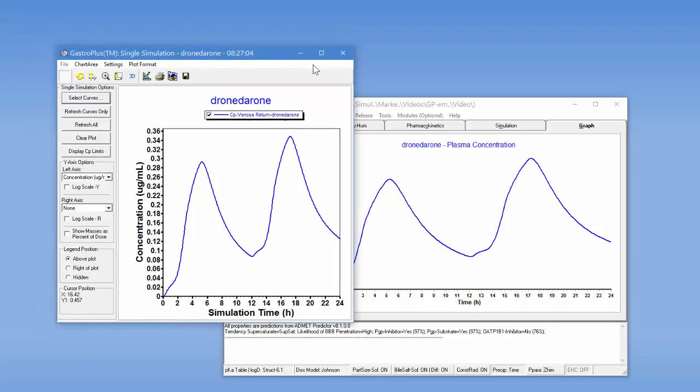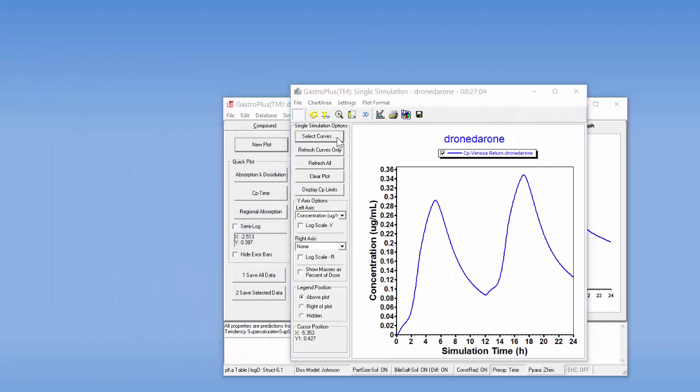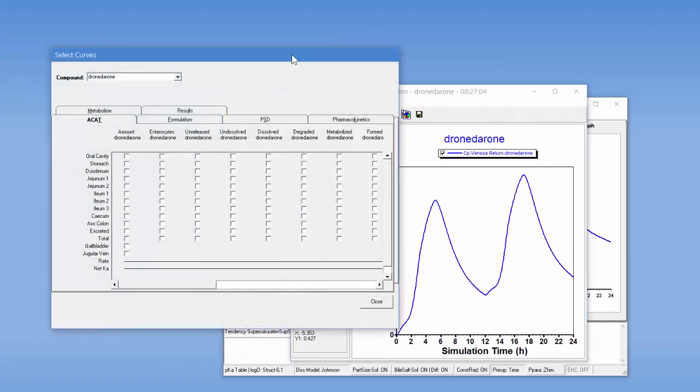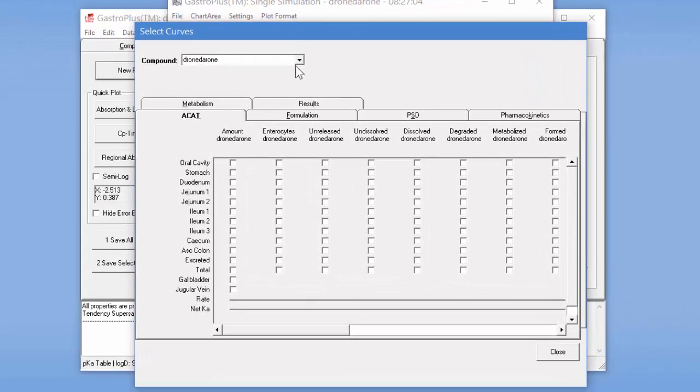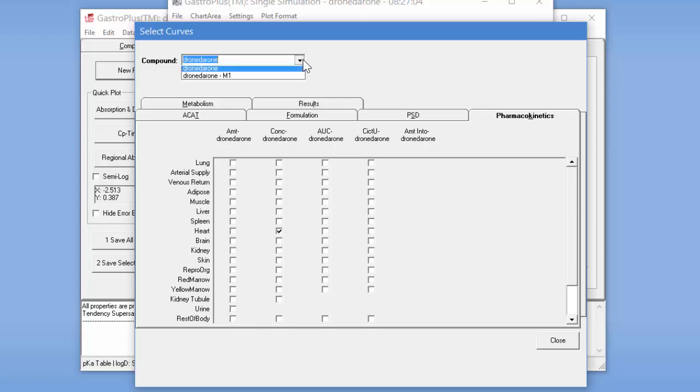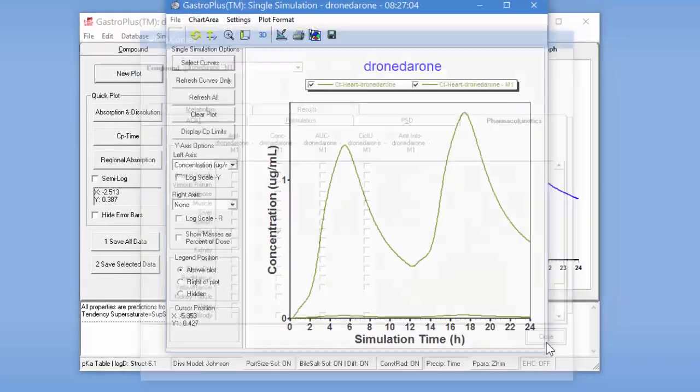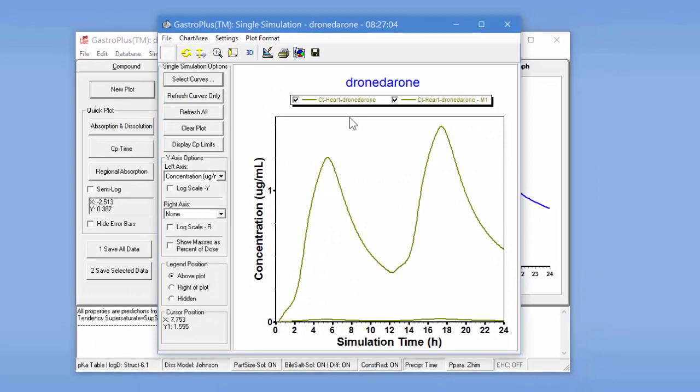If we click on the new plot tab, we can go and select curves and what we're going to do is we're going to take a look at Dronedarone, the parent in the heart tissue. And then we're also going to change it to the M1 metabolite and show the graph of that.